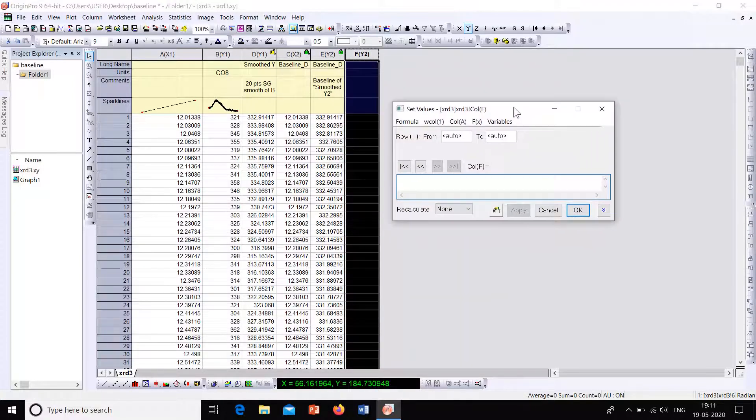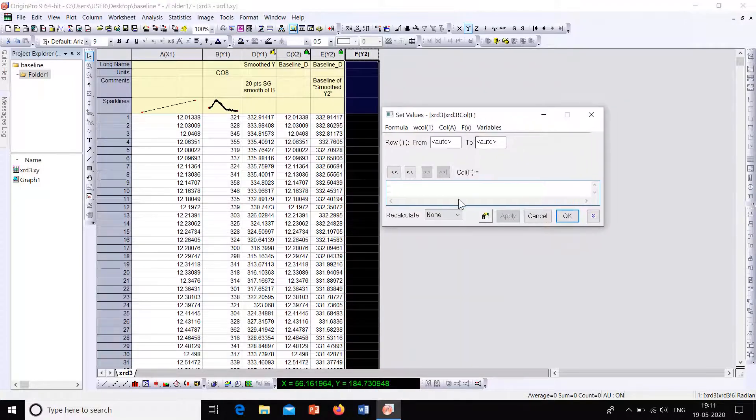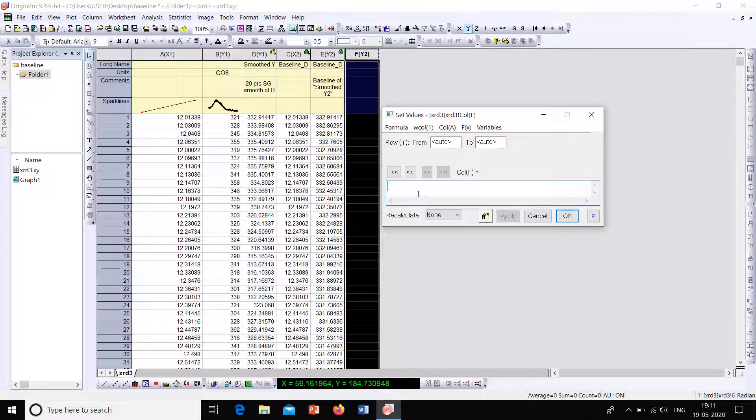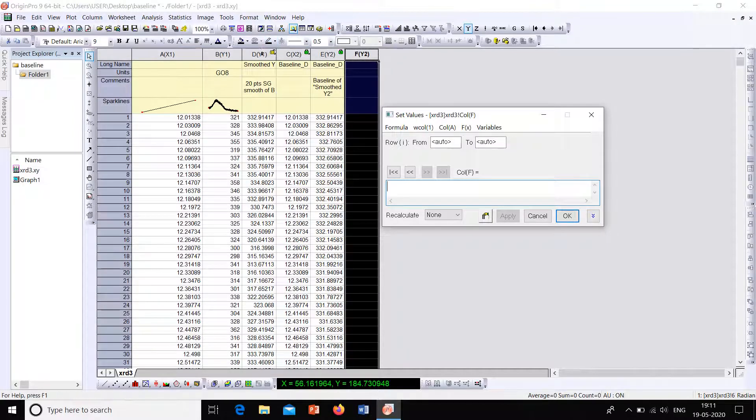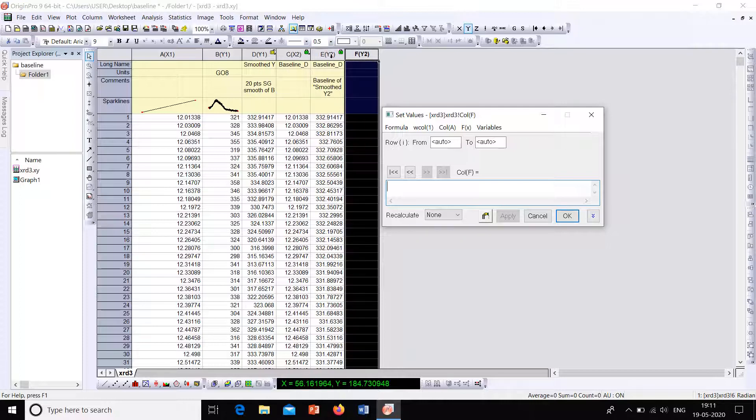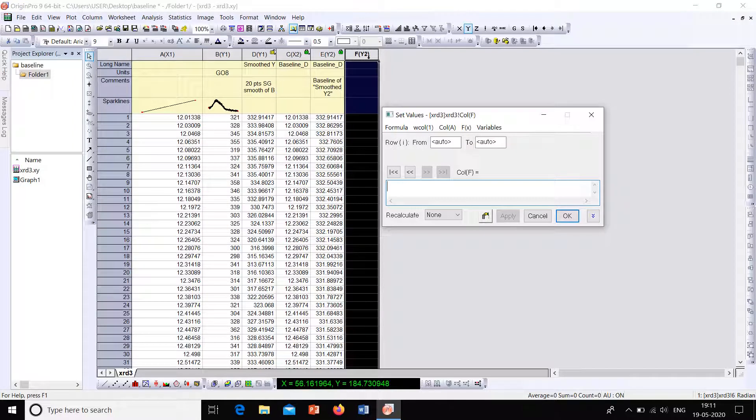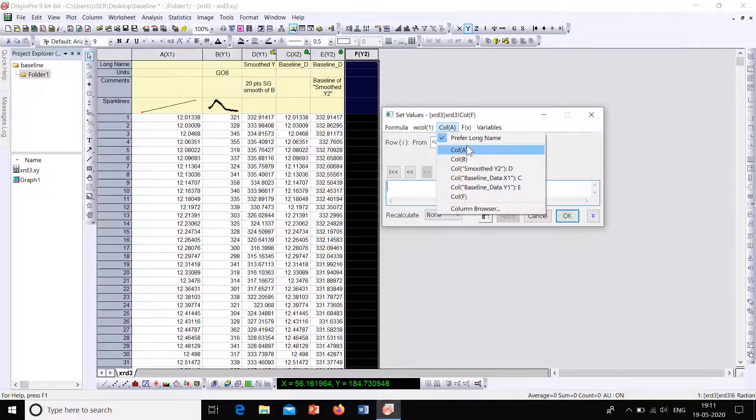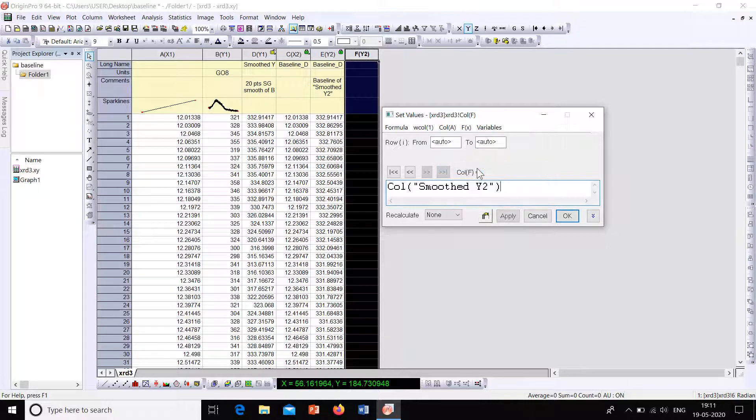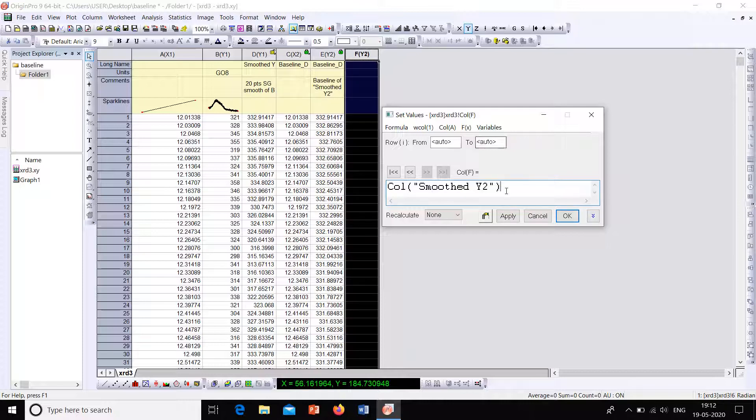So you will have a dialog box like this. And from this we have to do D(Y1) minus E(Y2). So D is the Y value for our original graph, and E(Y2) is the Y value for the baseline. So we have to subtract D minus E. So from here, the third option, select Column A. From there you can select Column D.